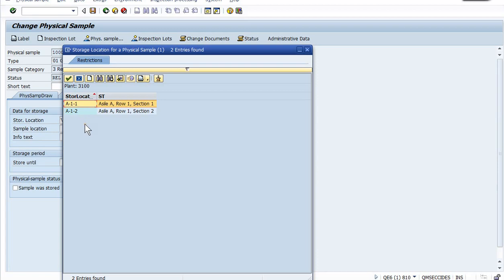You're going to want to create the storage locations. If it needs to be redone, you can do that at that time, but we have the opportunity now to really have rows and shelves and be able to get right to these samples that we have to pull at times when there are samples in question, batches in question.